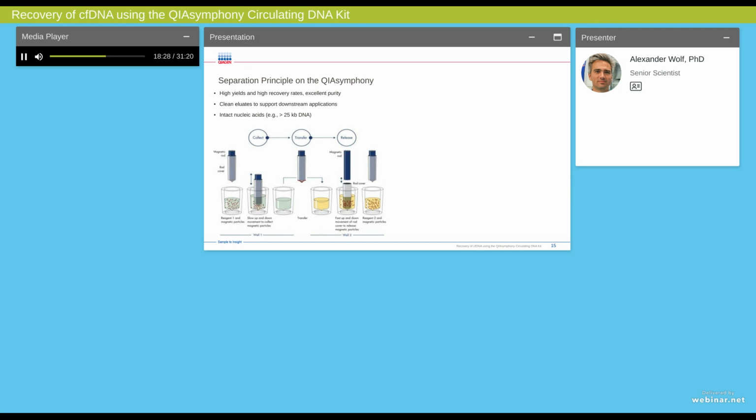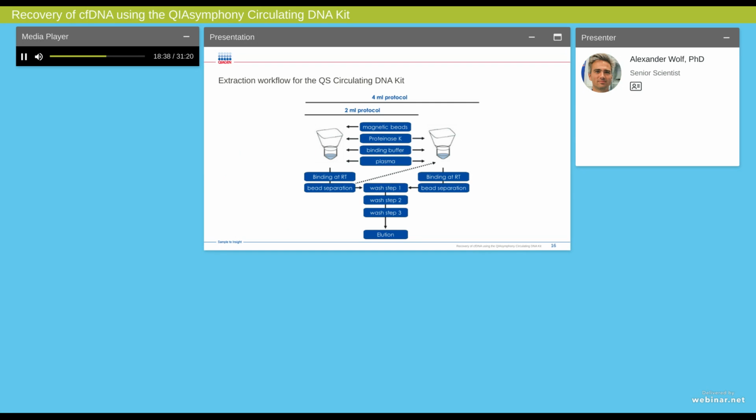The beads can be easily released into the liquid when the magnetic rod is separated from the rod cover, as shown here on the right side. By up and down movement only of the rod cover, the beads are mixed homogeneously in the processing volume and thereby ensure high efficiency during the bind, wash, and elution steps on the instrument.